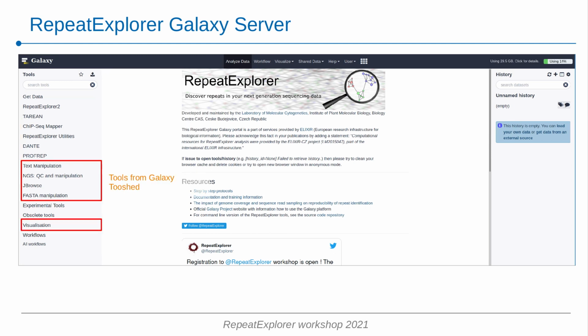Tools in the other group are various publicly available tools for generic manipulation, pre-processing, and quality control of various kind of genomic data. And these include, for example, FastQC program, which is a tool for a quality control check. You will use this tool frequently in this workshop.